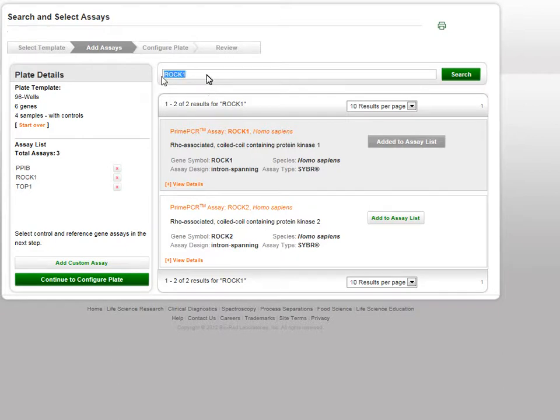When you are finished selecting additional assays and entering your custom assays, click the Continue to configure page.